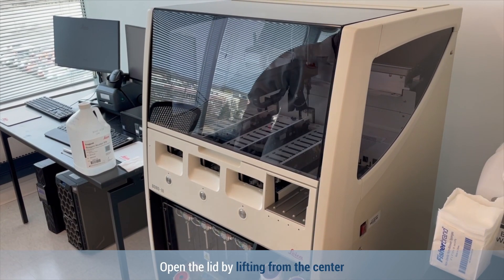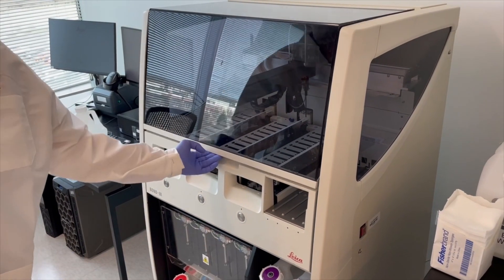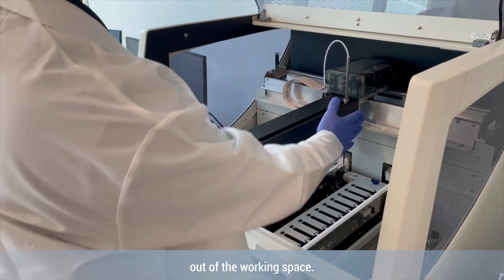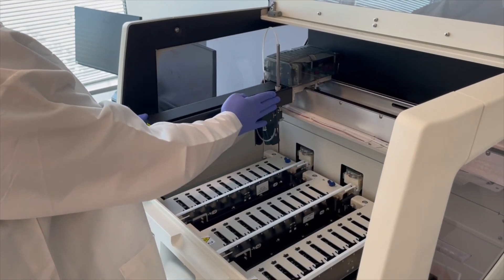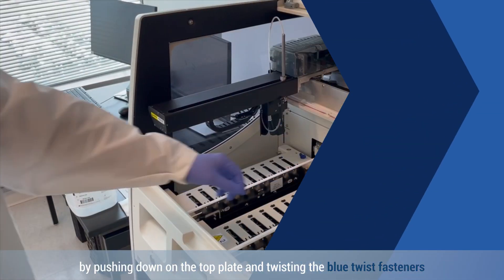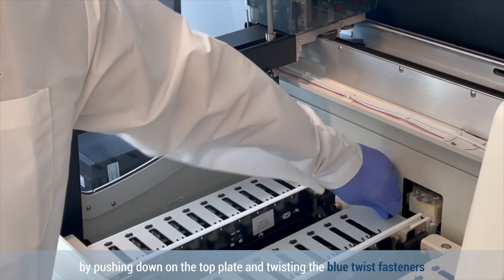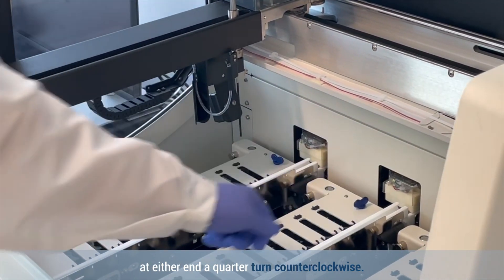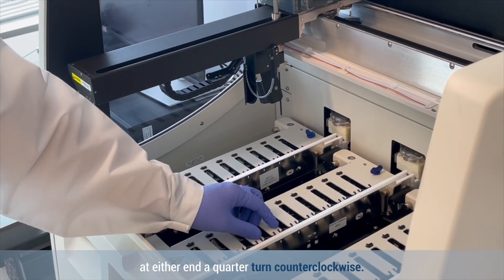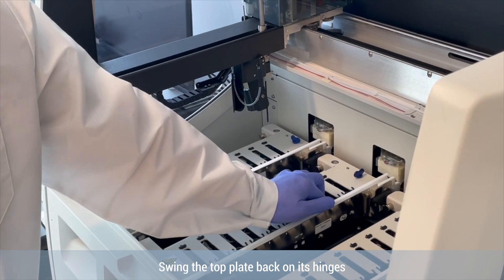Open the lid by lifting from the center and move the main robot arm out of the working space. Open the SSA by pushing down on the top plate and twisting the blue twist fasteners at either end a quarter turn counterclockwise. Swing the top plate back on its hinges.